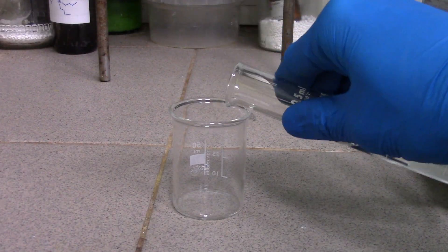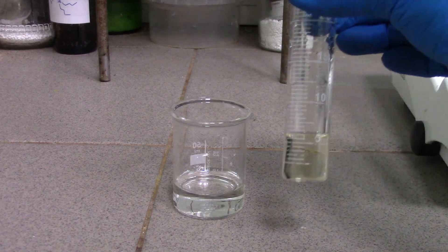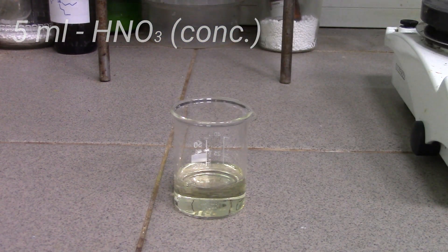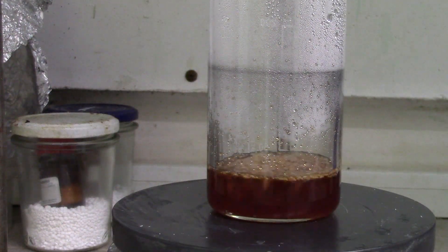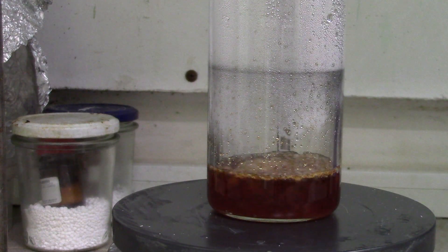While water was evaporating, I prepared an oxidizing mixture containing 15 milliliters of concentrated hydrochloric acid and 5 milliliters of concentrated nitric acid. Now let's add it to the tetrachloropalladate solution.